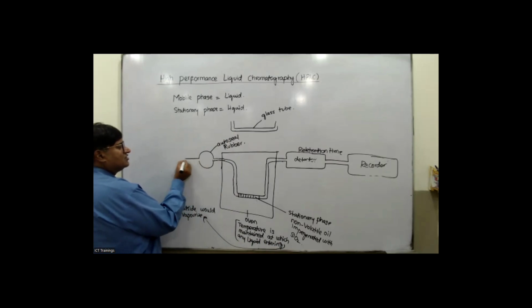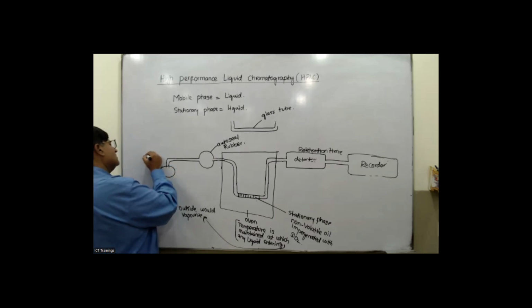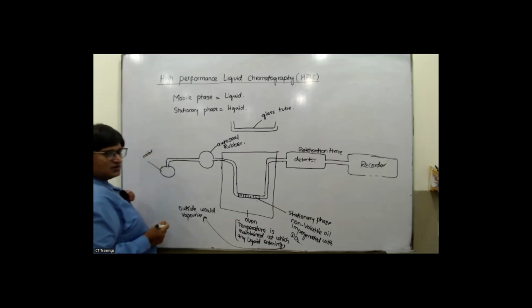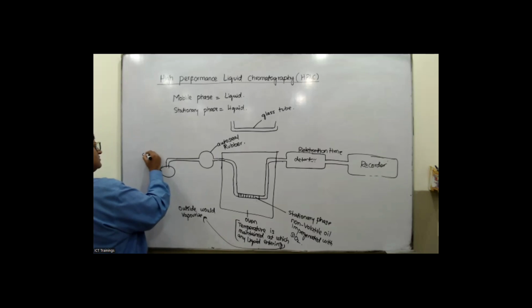So this auto seal rubber, my dear, is attached with a motor. This is the motor, okay. So this motor, or this is called the sucking pump, okay.